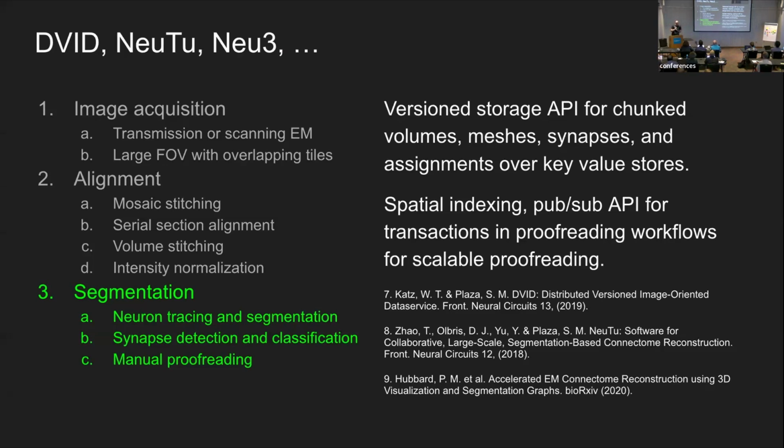Meanwhile, at Janelia, the FlyEM team developed proofreading tools for FIB-SEM data sets. What you've seen so far are TEM data sets. At Janelia, we're doing two kinds of data: TEM, non-isotropic EM data sets, and isotropic FIB-SEM data sets. For these FIB-SEM data sets, the FlyEM team had collaborated with Google to generate automatic segmentations.